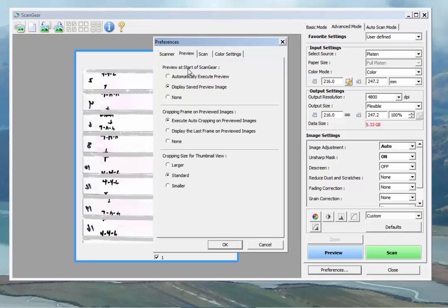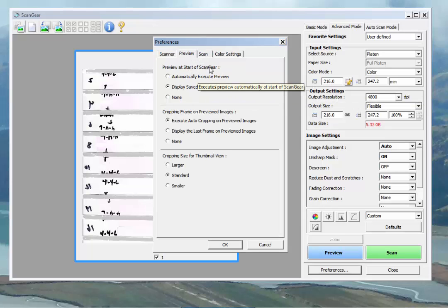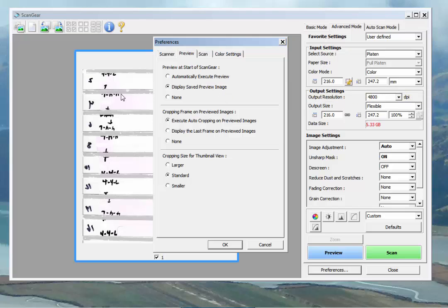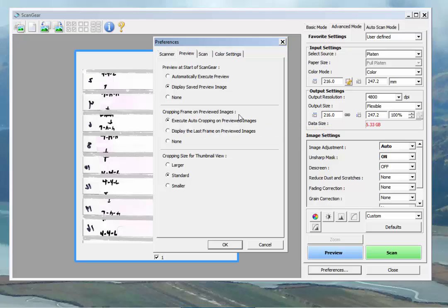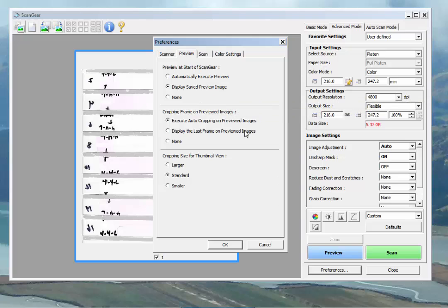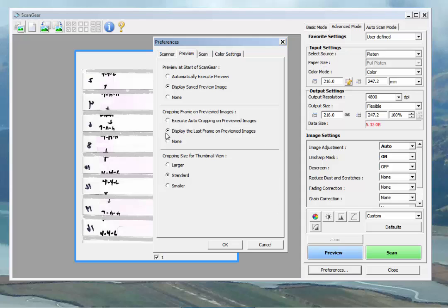We'll go to preview. Preview at start of scan gear. Display save preview image. So that's the one that's pulled up from last time. If you're using the scanner repeatedly for the same thing with the setup that we've already talked about, that's useful because then you don't need to go through and do a preview. The default is execute auto-cropping on previewed images. We don't want that. We want to display the last frame on previewed images, and that will keep our scan areas.